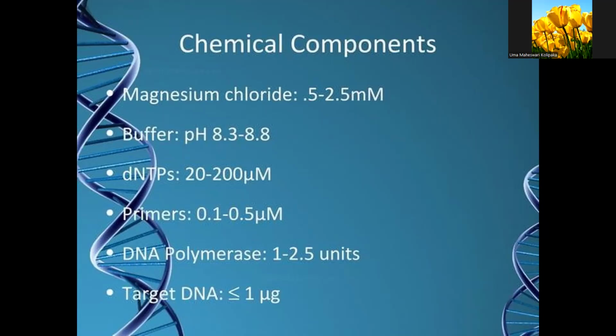Basically, we have to incorporate all these things into the tubes, that is, we can put them into the thermal cycling machine, so that's next.